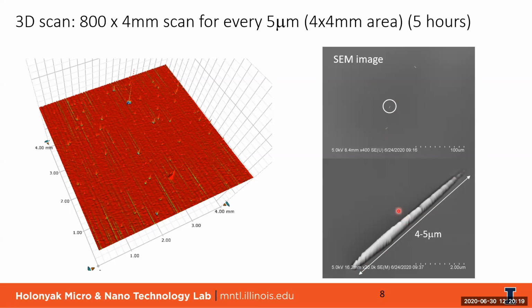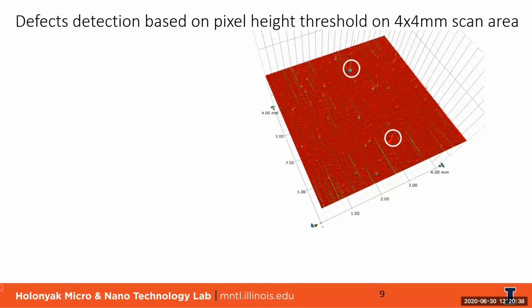I was quite surprised it still gets picked up. I guess it's because the length of the defect is fairly long. It still gets picked up by our stylus profiler. So because of that, it can pick up those defects. Then I thought maybe we can do some defect density estimation in terms of the density.